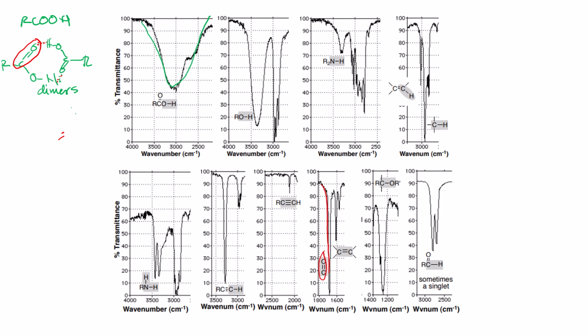and that is a very intense band at about 1700. But there are other compounds that have carbonyl bands. Examples of other compounds with carbonyl bands are ketones, aldehydes, with the carboxylic acid, of course. We will have esters and amides. They show in about the same region, but slightly shifted.